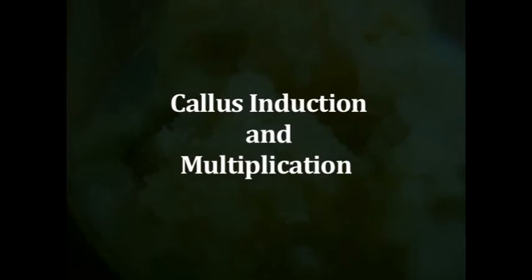Callus induction and multiplication. Let us now see callus induction. The most suitable explants for successful callus formation are often young tissues of one or a few cell types, like the pith cells of young stem. Callus induction on explants in vitro generally initiates from peripheral layers as a result of wounding and in response to growth regulators, either endogenous or exogenously supplied in the medium.